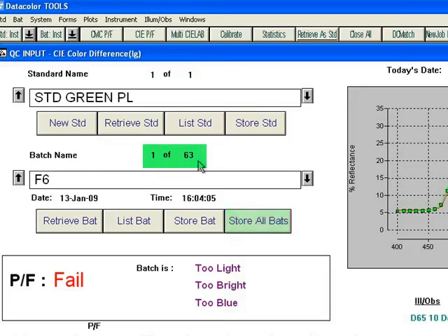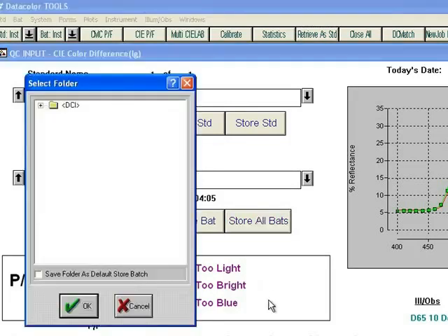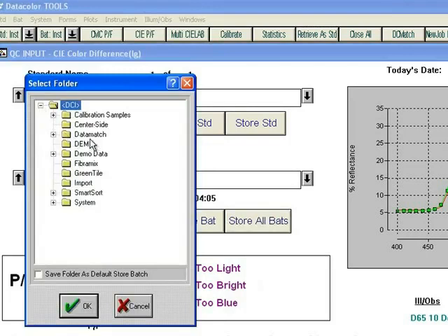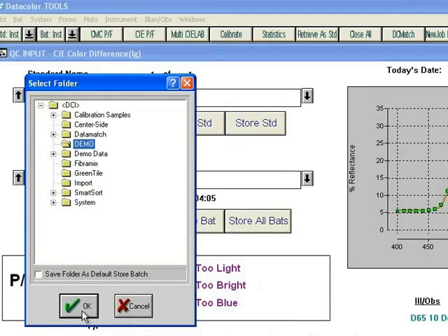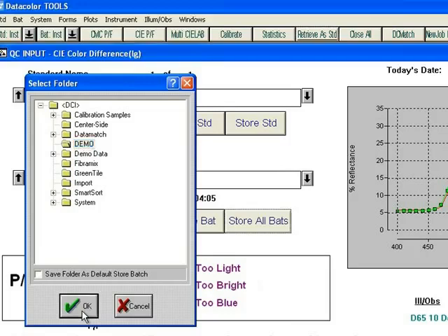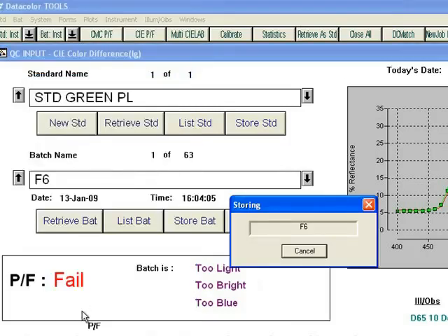For this demonstration, we will store all the batches to the Demo folder. You will notice that the system lists the batches as they are being stored.